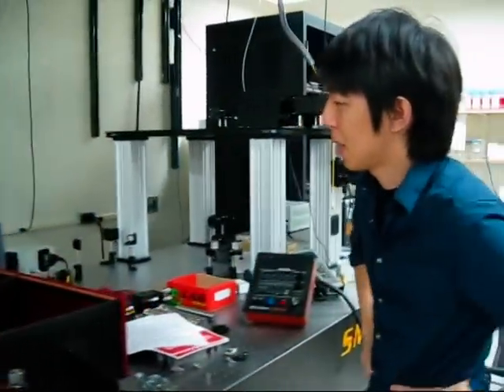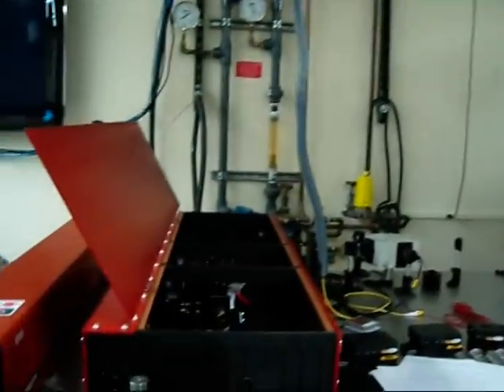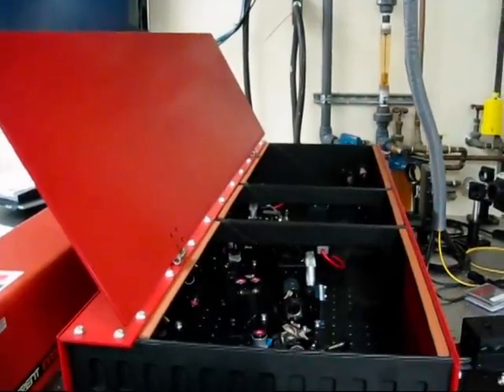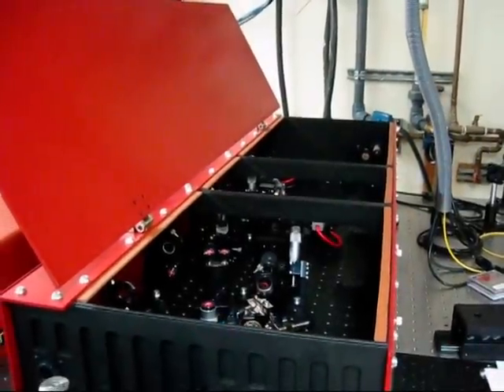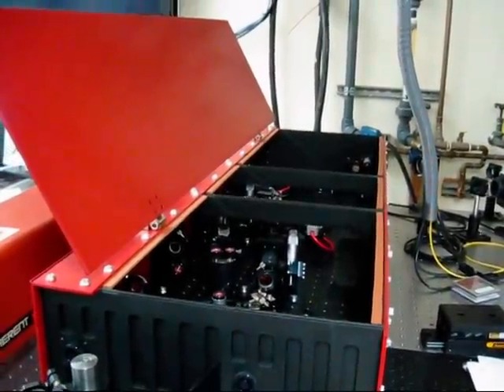You guys had sent us the box and we received it, put it on the table next to it. It was pretty straightforward — it kind of adjusted them to the same height and steered the beam in. Pretty much it was fairly straightforward to get it mode locking.